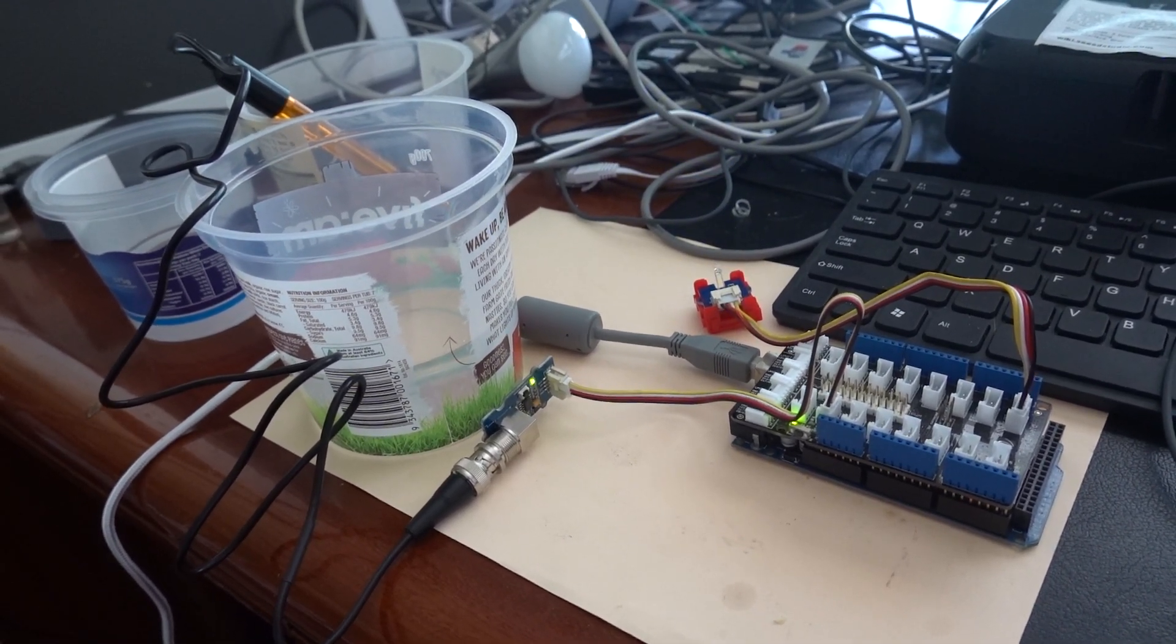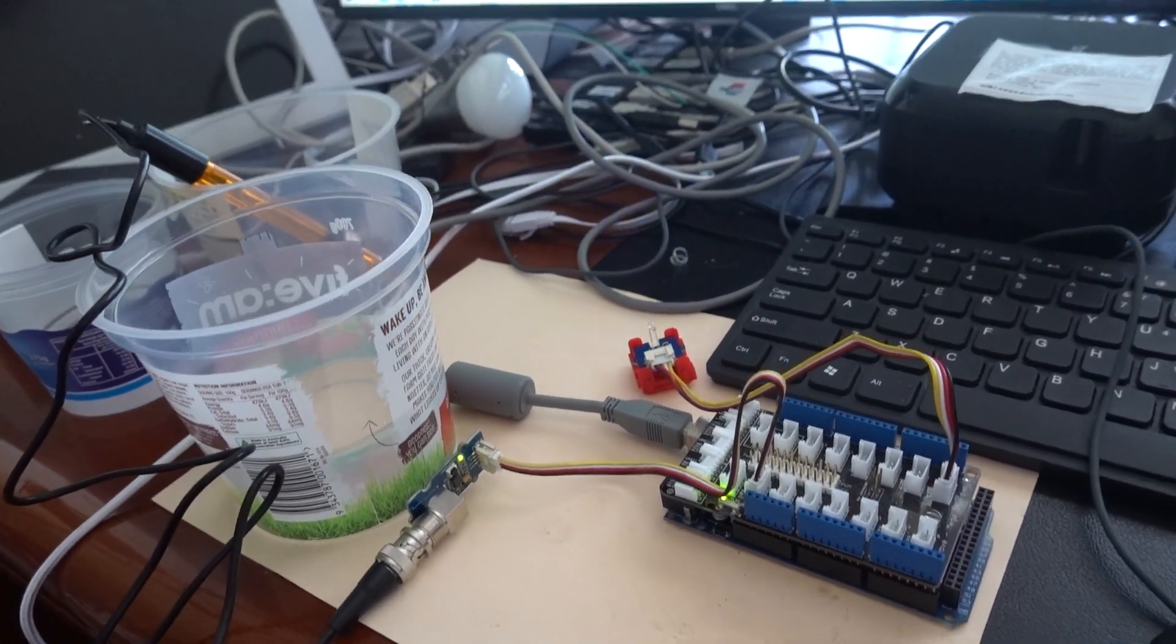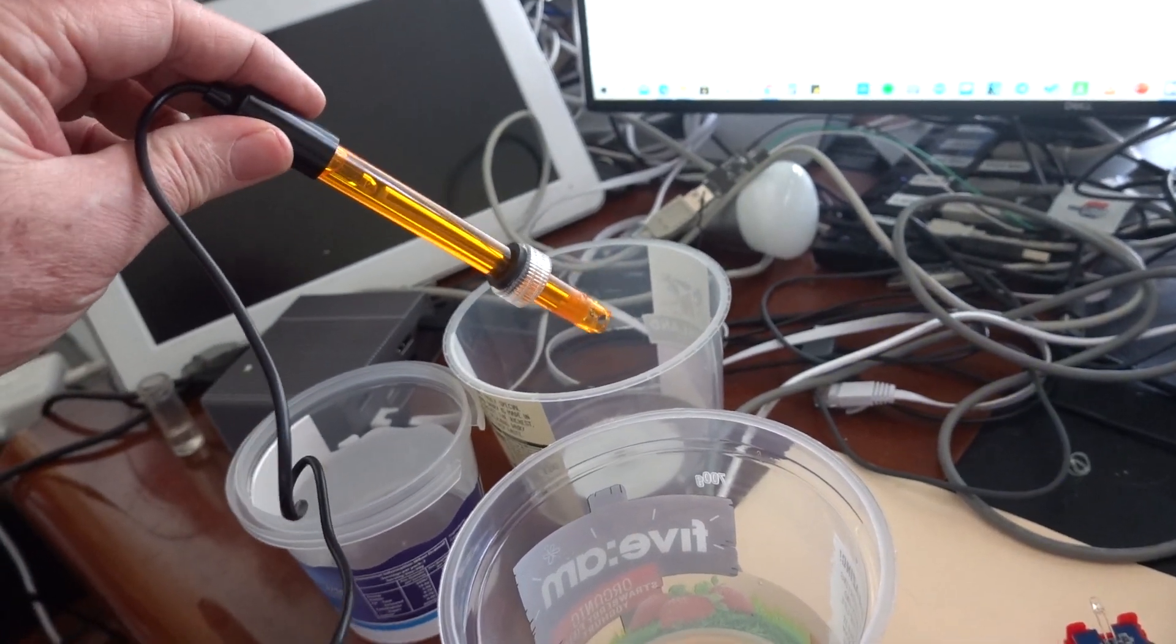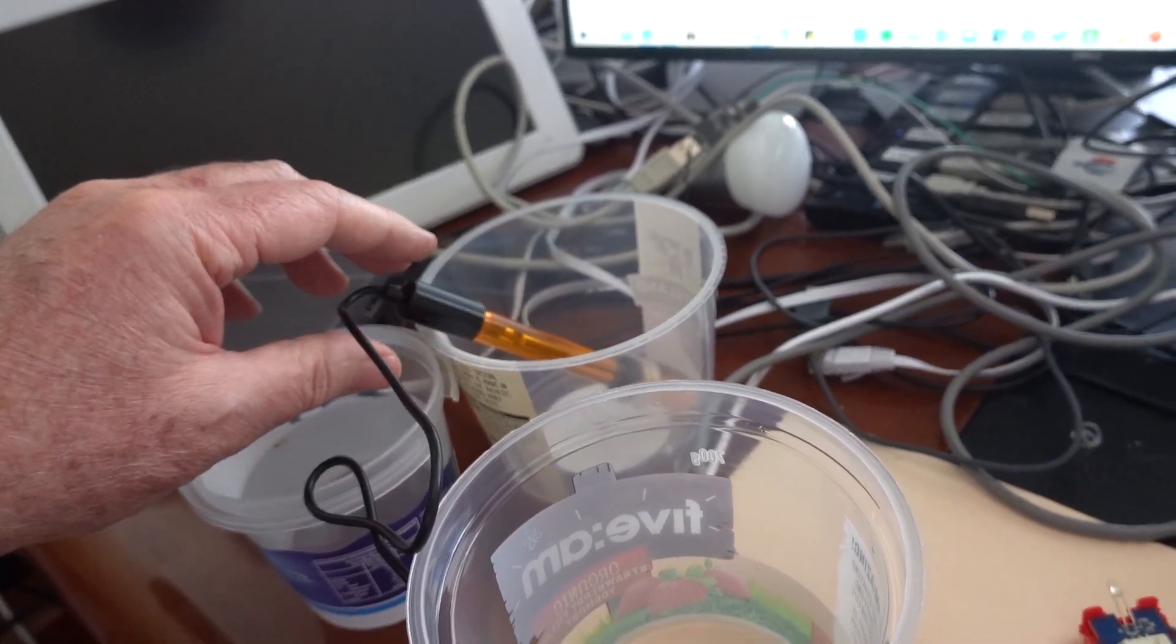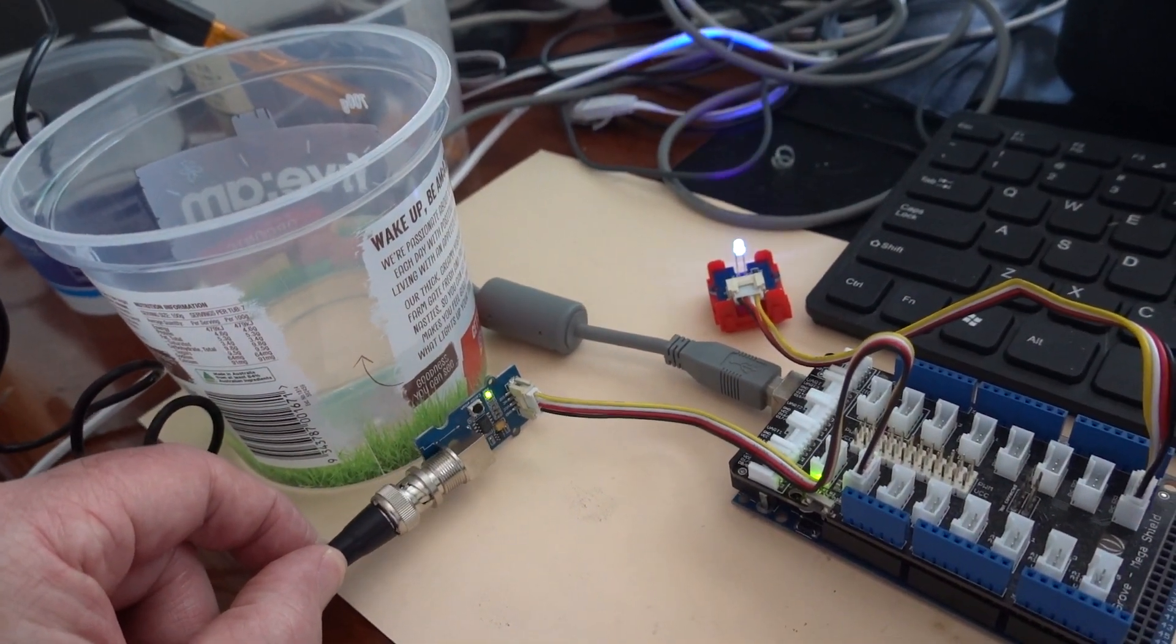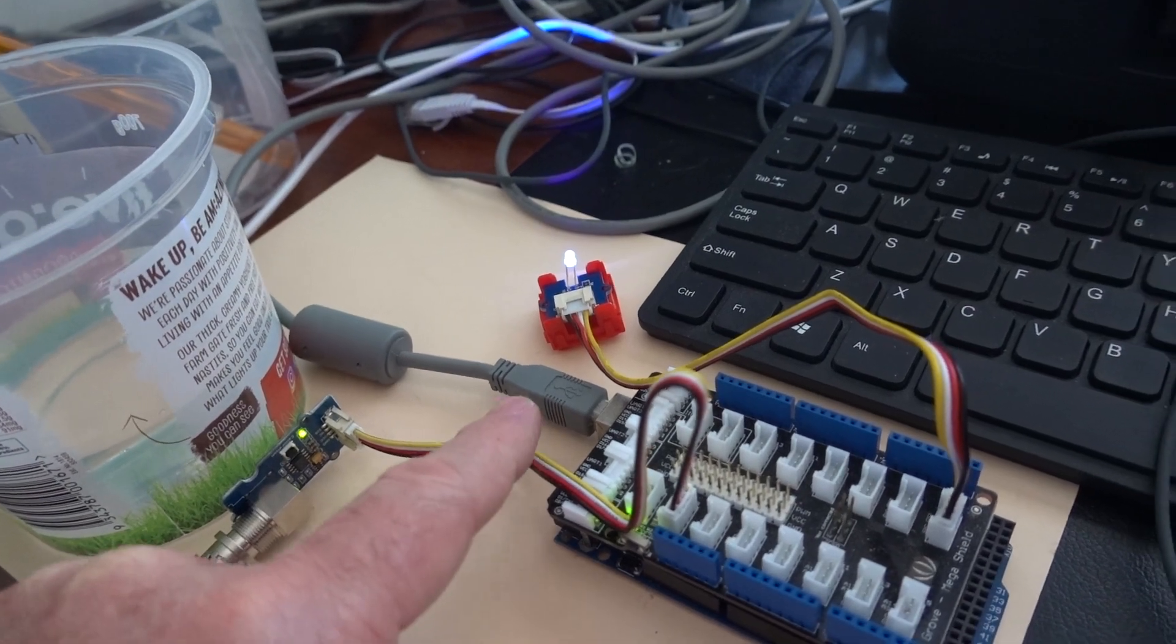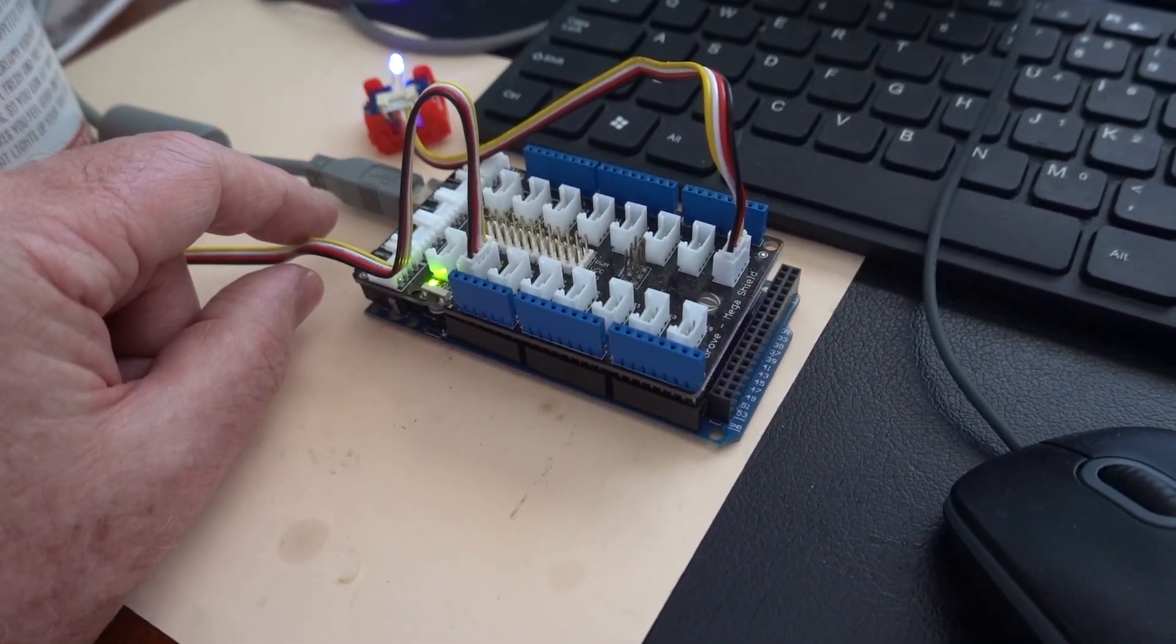ORP stands for Oxidation Reduction Potential and I'm using a Grove ORP sensor, which is this one. At the moment it's in the dry area collecting data via the Grove interface connected to the BNC cable, and that relays the data in analog form to an Arduino computer via the serial port.